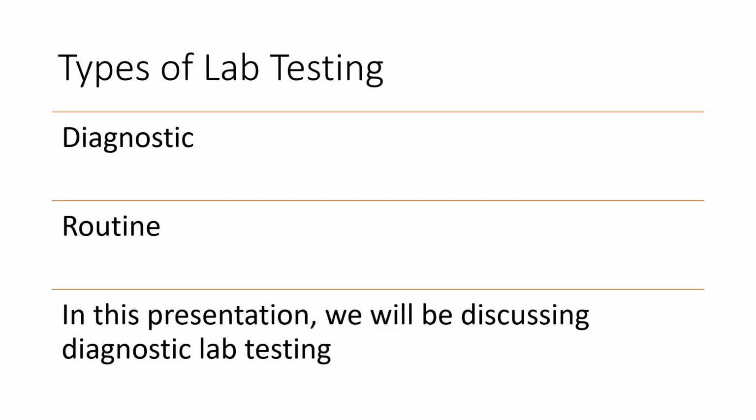All right, hello again. So I'm going to lead off with just a couple of definitions here. Usually we refer to diagnostic and routine testing. This presentation will of course be focused on diagnostic lab analysis, but there are a couple of distinguishers between these two types of testing. The primary thing is diagnostic lab tests tend to be more specialized and intended to address a specific concern, whereas routine tests you are required to run for the operation of your plant, such as looking at effluent values.